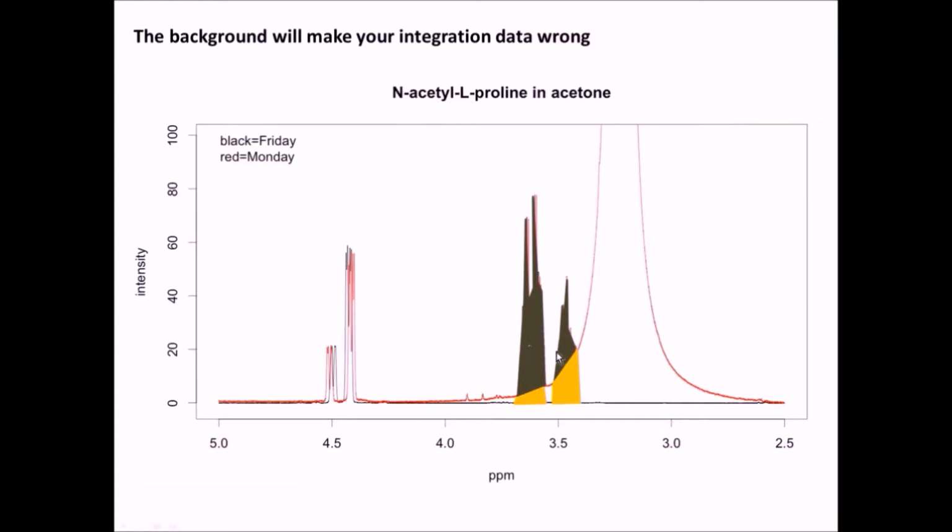So right now your integrated NMR signal includes two parts. The first part is the gray one. You can use this part to extract your ratio of molecular conformation, and the yellow part is actually from the water signal. We really want to get rid of it.